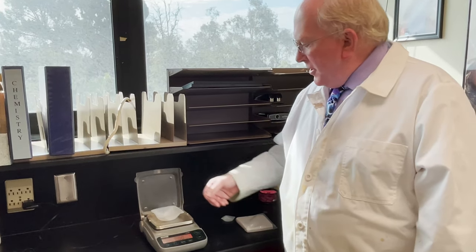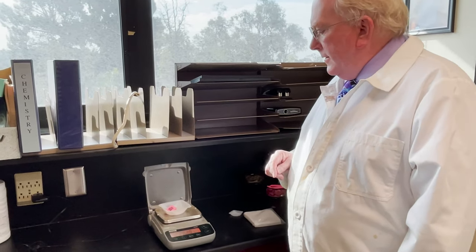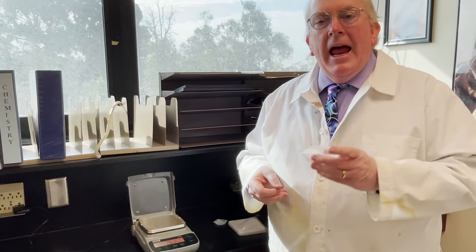Now you can put objects inside there. You'll get their mass and you don't have to subtract the mass of the weighing boat. This is also very convenient because you can pick up the weighing boat and it can go back to your lab station with you.